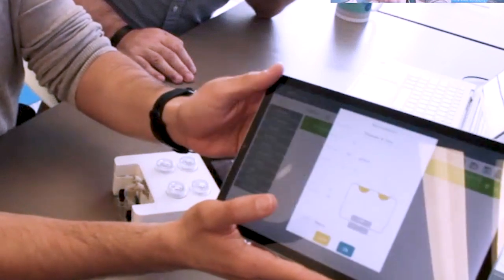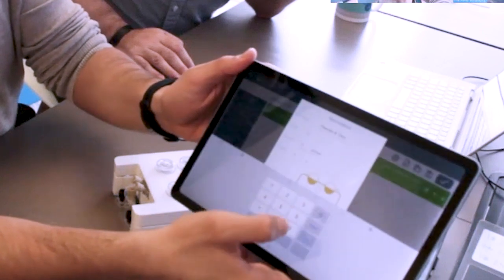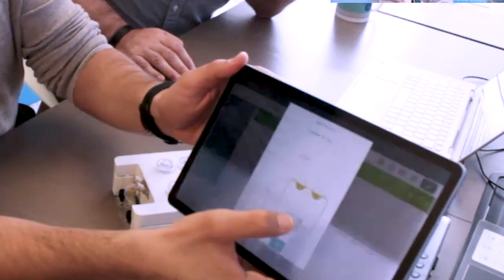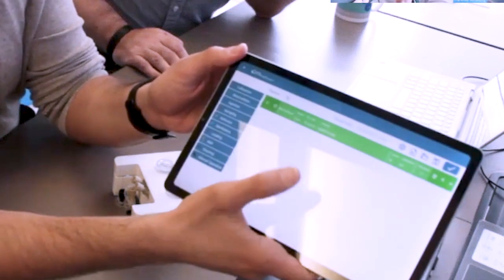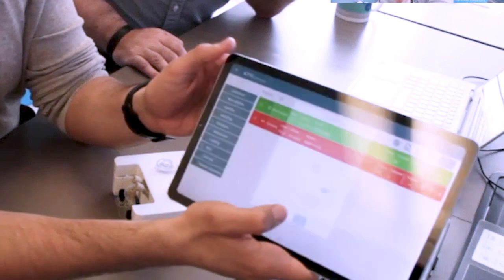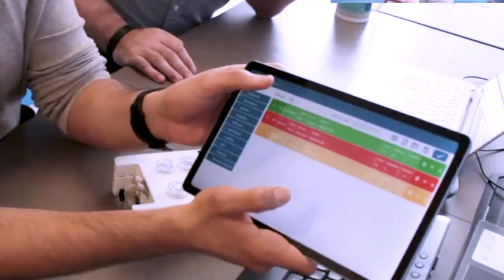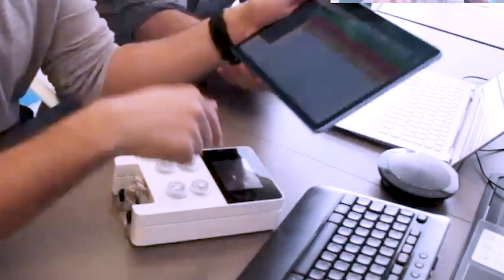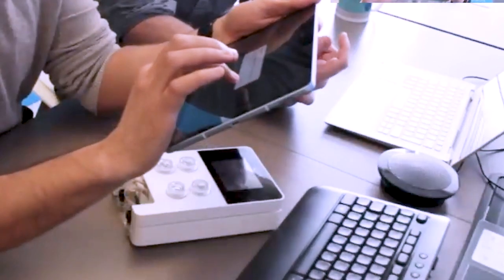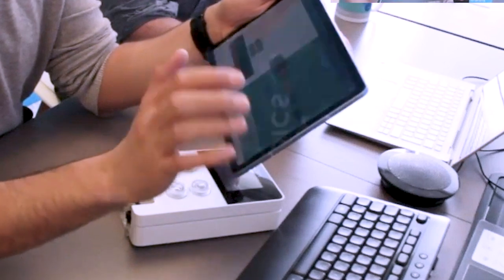By dragging and dropping, for example, a recirculation step, here I can put, for example, 10 microliter per minute. Then I can inject a steady flow rate, and this is working like this. So I'm injecting some functions and I'm building my protocol. When it's done, I just save my protocol and then I launch it directly to the OMI, and then it's running.